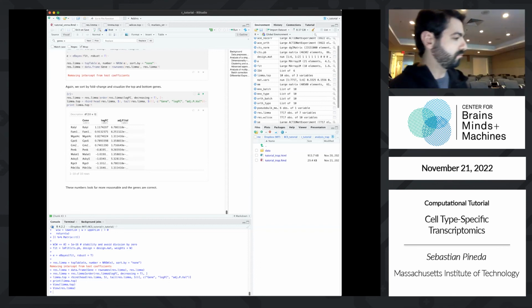Okay. And then the second question is, in the sequencing machine, basically, you take the RNA from a nucleus and you convert it into cDNA. And during that step, it's amplified, right? So one RNA is turned into many cDNAs. So should I be worried that multiple read counts are actually coming from one RNA that's been amplified a bunch of times? Or is that taken care of?